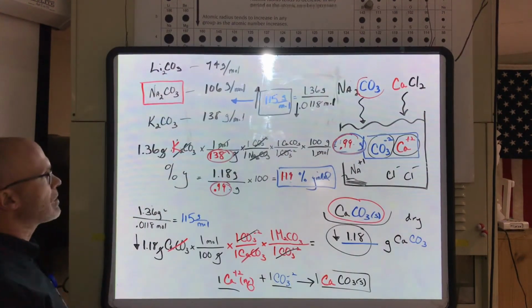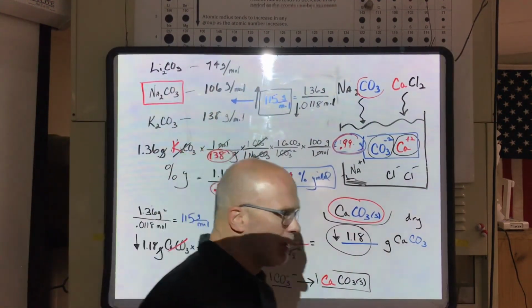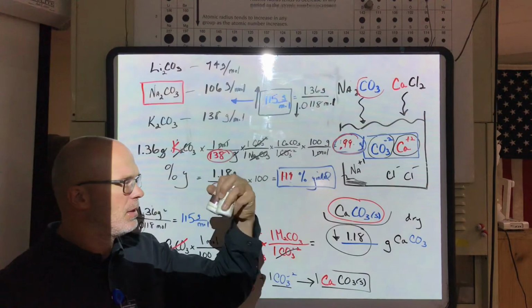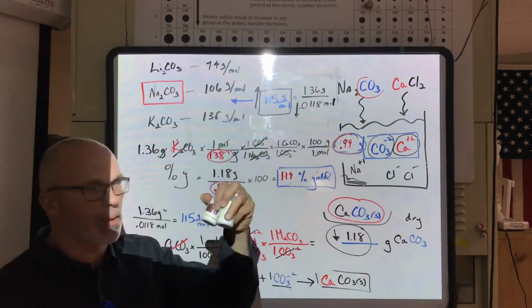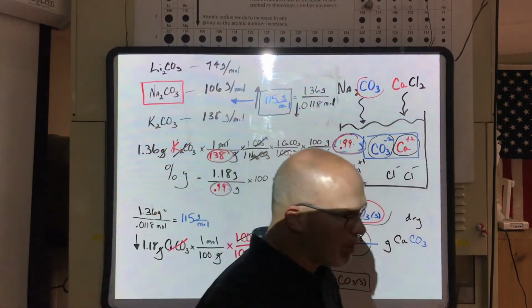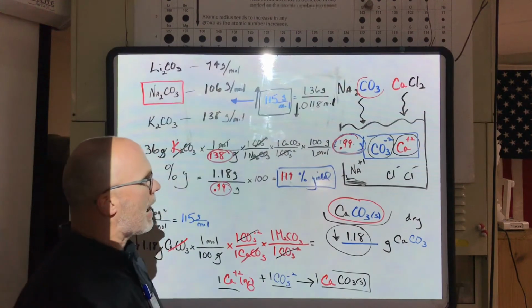Well, number one, let's look at the numerator, 1.36. There's no possible way, no matter how much money I spend, that these chemicals are 100% what they say they are. There has to be some impurities. If there's 0% impurities, these things would be $10,000 per bottle. It's just impossible for us to afford that, or even for the companies to actually make them. So there are some impurities. The question is, what do those impurities do in terms of precipitates? Are they adding or not?